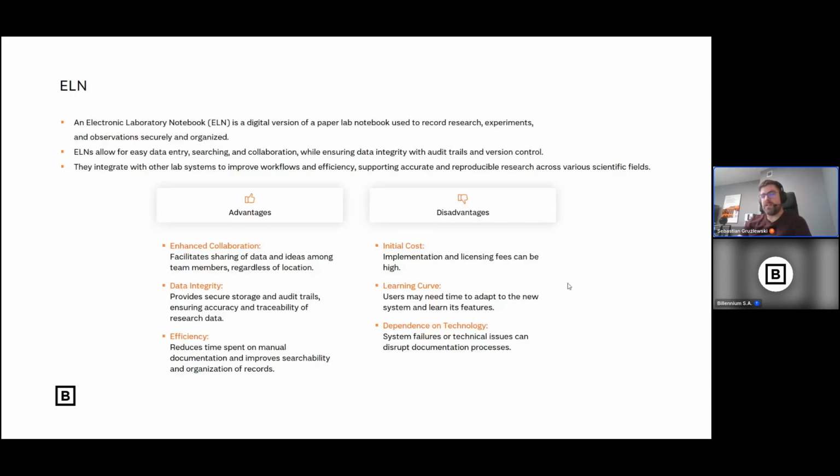This system mainly enables collaboration and sharing results, and all these results are available to export. So what is commonly done is you can export this and perform some kind of statistical analysis to discover new things that are common for your results. As for advantages, as I said in the beginning, you gain a way of storing your data in an organized way.